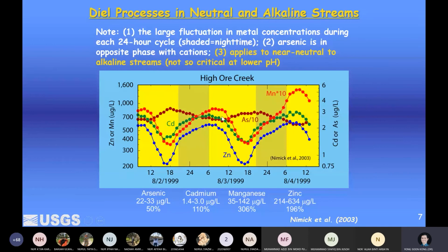So you can see most of the heavy metals, they are very stable. At least these are what is so-called the baseline. These are the state where the changes can be said at the minimal. But if you take your water sample after 12 o'clock, you're going to see a sudden dip. Arsenic remains the same, but the others suddenly dip very low. Does that represent the level of concentration or level of pollution that you are supposed to analyze?